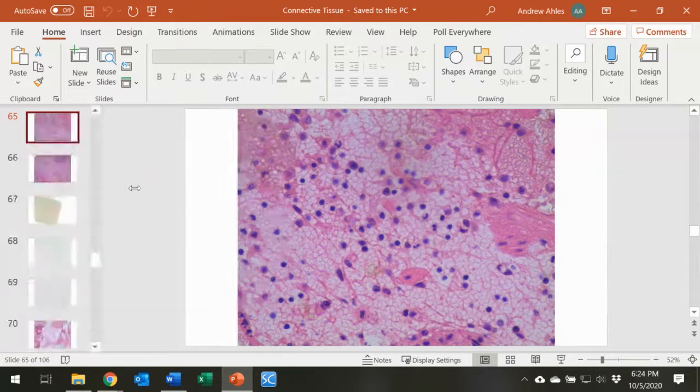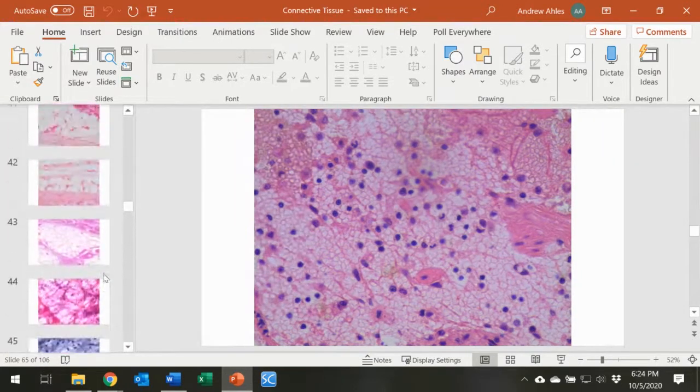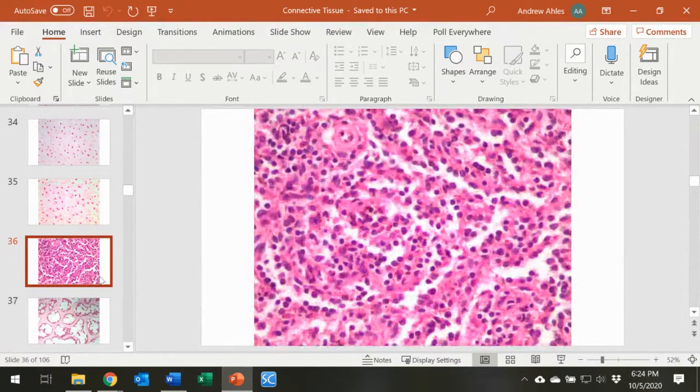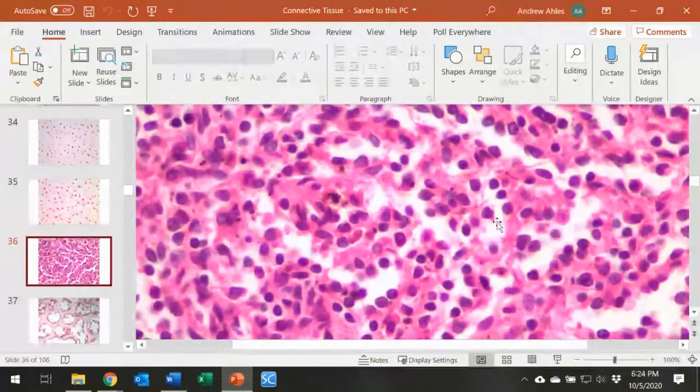I know I saw one other one. Let me pull that up too. It's not as pretty as that one. Here's my other reticular image. I know I got some student questions about this one. This one isn't quite as clear, but if you look closely, so I'm zooming way in here, you see how there's this little line in between here and it's kind of running over here.